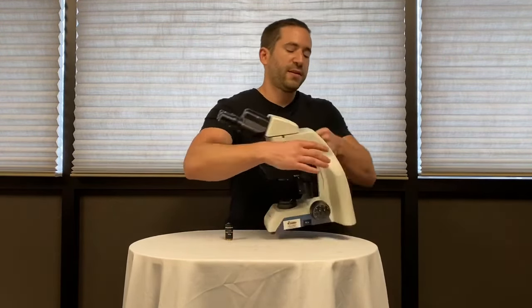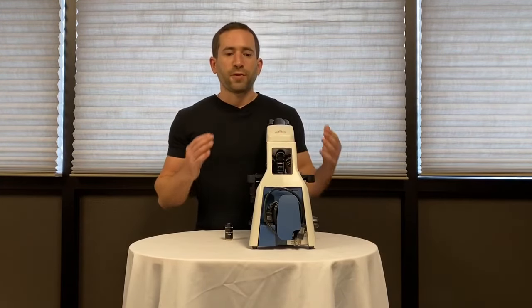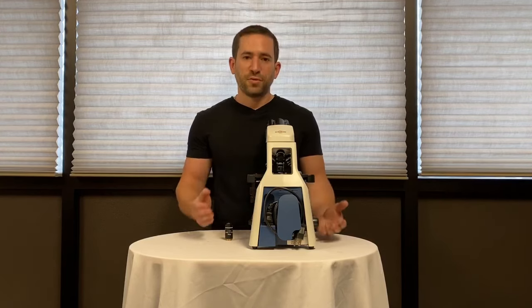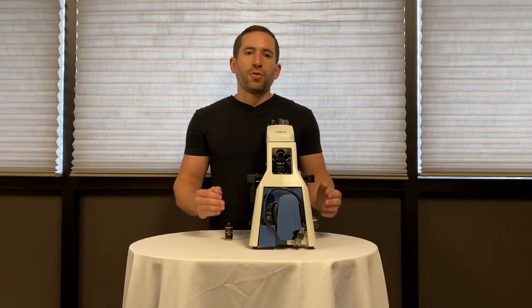A convenient carry handle and flush mounted cord wrap make it great for transportation and storage. All internal brass gears make the microscope suitable to withstand years of use and the microscope is backed by a 5-year mechanical and 5-year electrical warranty.